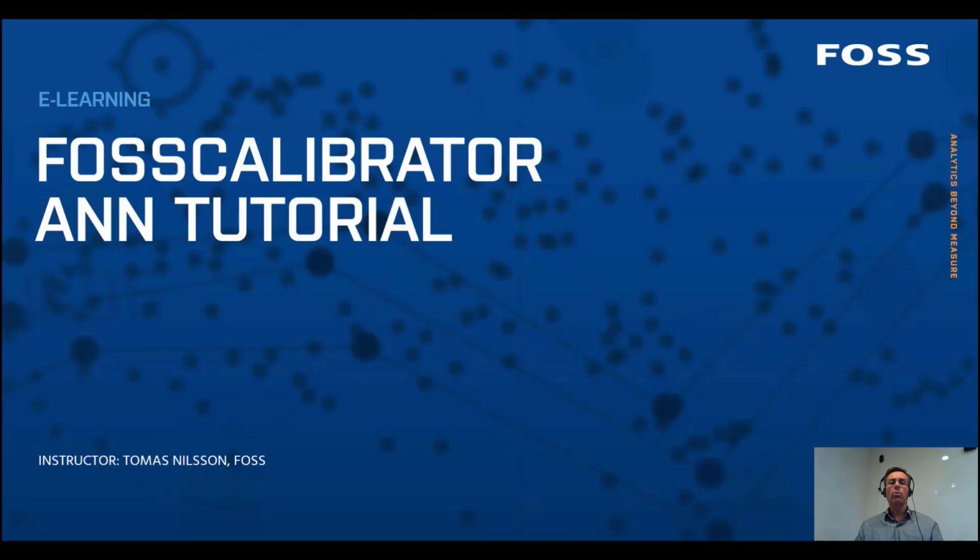In this tutorial, I will show you how to develop an ANN calibration. I will also benchmark it against PLS and show the impact of the database size on performance. The data used will be from an Infratech instrument. The product is corn or maize with an extended range of the moisture content from 4 to 53%.